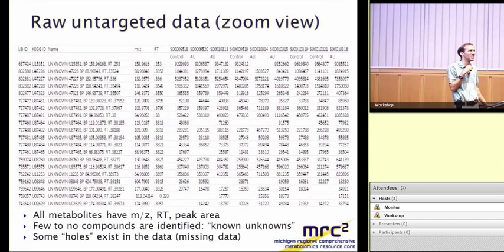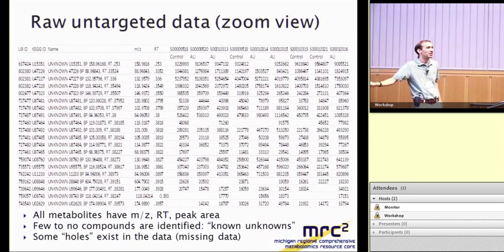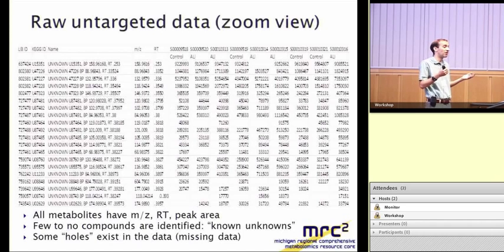Yes, I see a question. So there's a lot of things you can do. You can say, exclude for me when you go to do your data analysis, exclude anything that has any missing features. That's the most conservative. Probably you'll miss a lot of valid stuff.